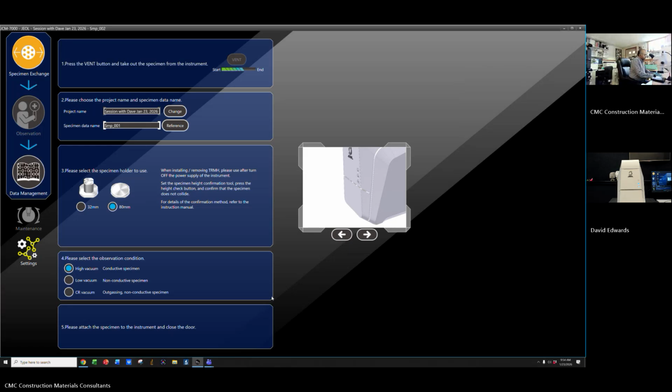Now, one thing I might suggest is powering everything down, just turning everything off and turning it all back on again. So let's see if I can turn that computer off. When you do that, though, you're going to kill the meeting. I do power off my SEM at the end of a run. But that didn't help. Shoot. All right, then I don't have a good answer.